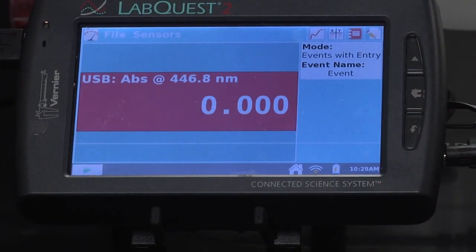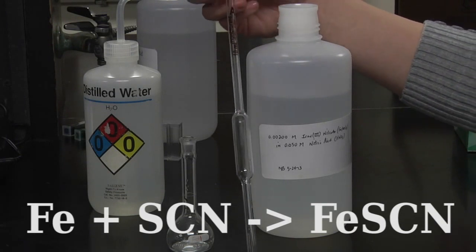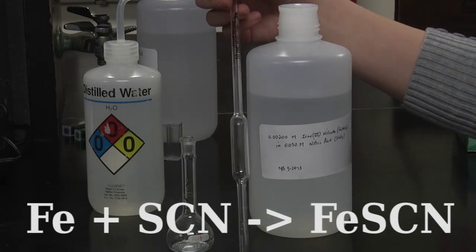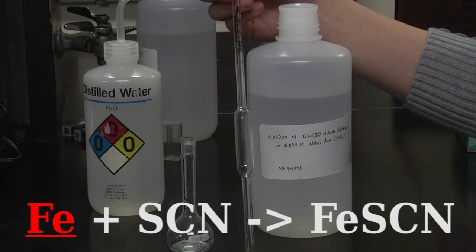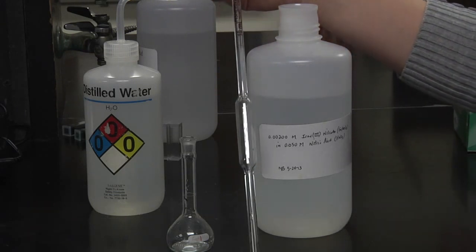Now we are doing part one of the procedure and making our dilute iron solution. Right here I have a 10 milliliter volumetric pipette and I'm going to be filling it with 0.002 molar iron nitrate. Fill it to this line, the calibration mark.